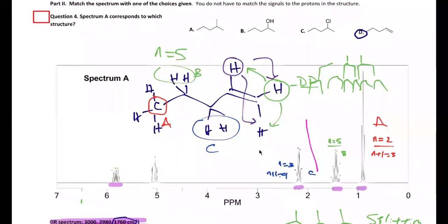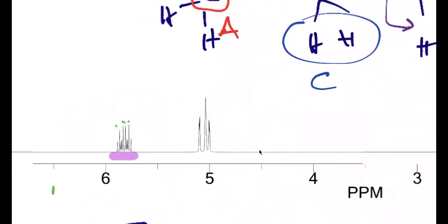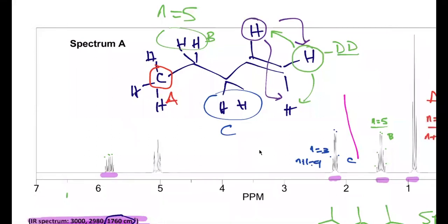All right. So the last example that we were looking at, this first spectrum, we said it was the alkene, and one of the peaks was really weird. Like one of the alkene peaks down here had a whole bunch of really weird multiplicity, and what that pointed to again was complex splitting, right? And it was this hydrogen right here that we said would have been split into just this weird pattern down here, right?